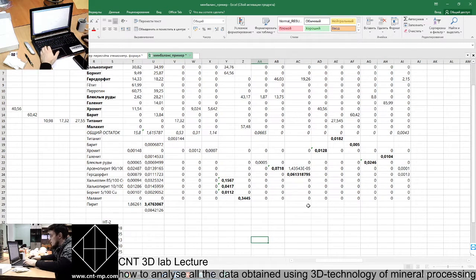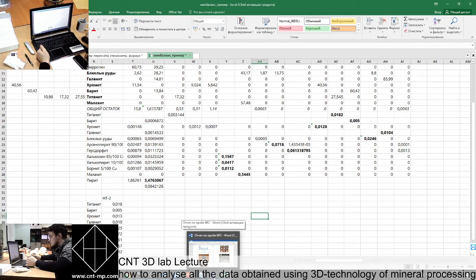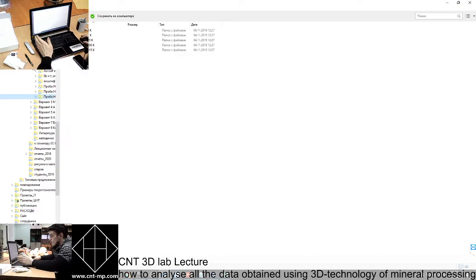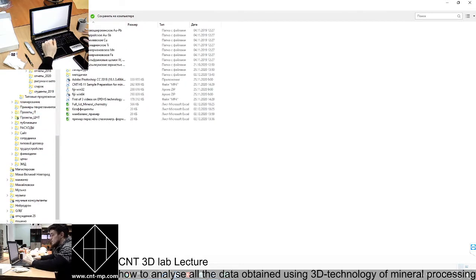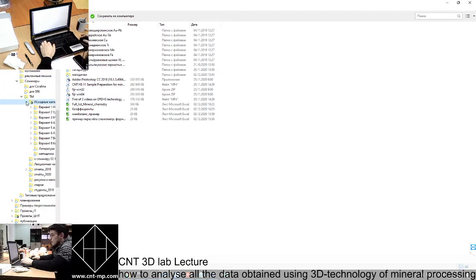The express way of receiving that data is to perform diffraction analysis, XRD, but it has its own limits, as when the content of a particular mineral is less than 1%, it is impossible to say whether that analysis is true or false, because when you analyze it, the diffraction scheme is analyzed by a real human.